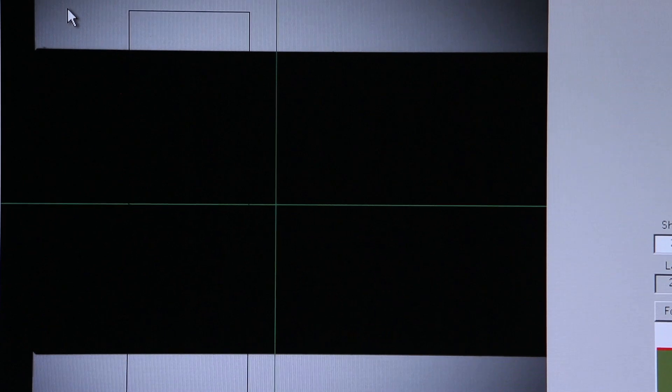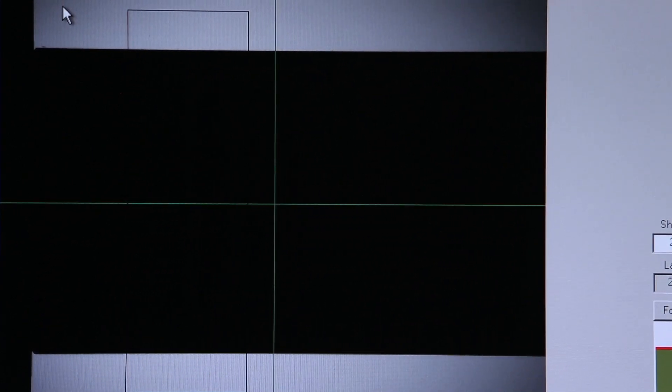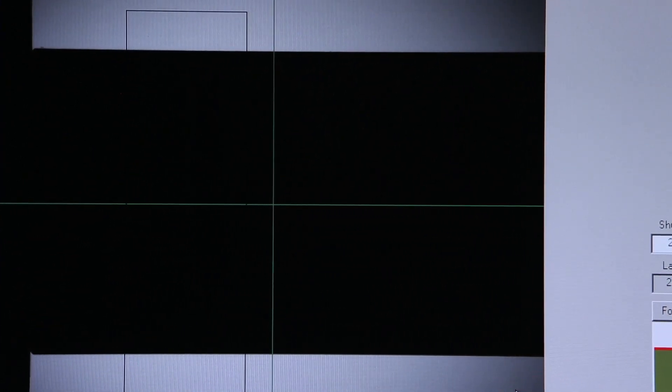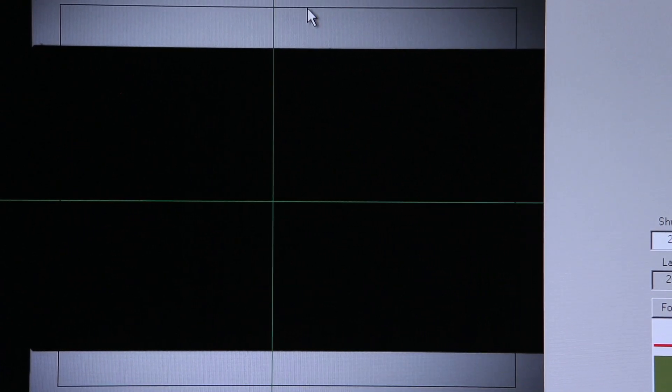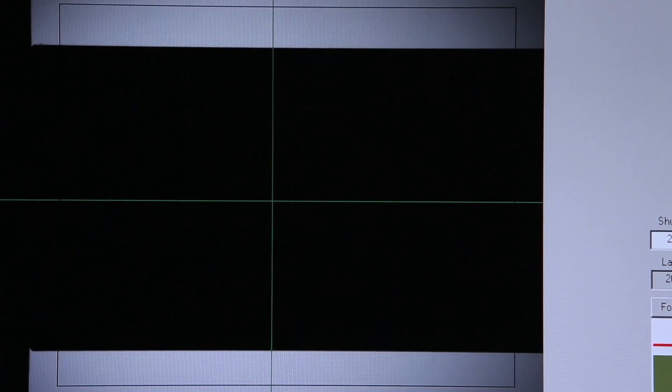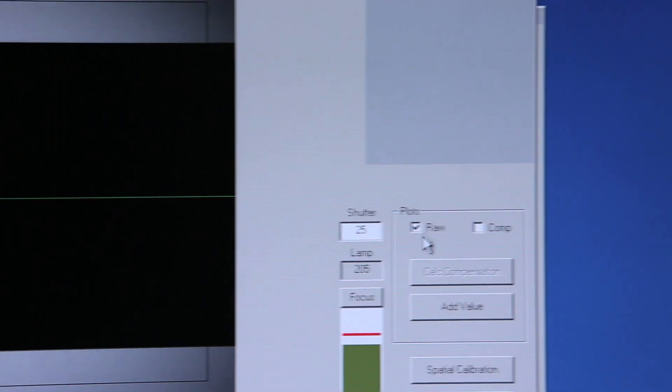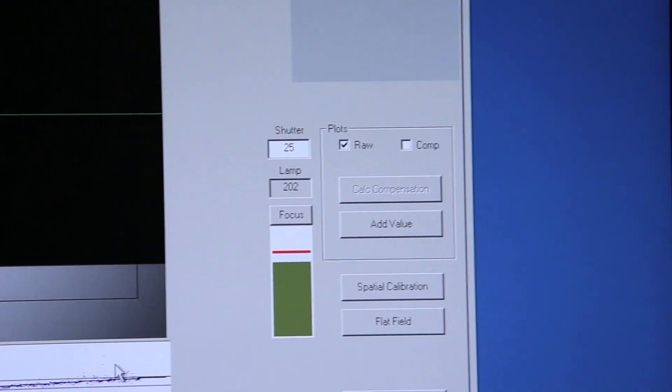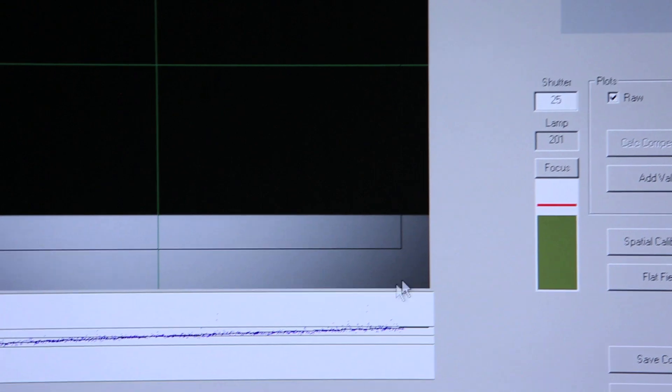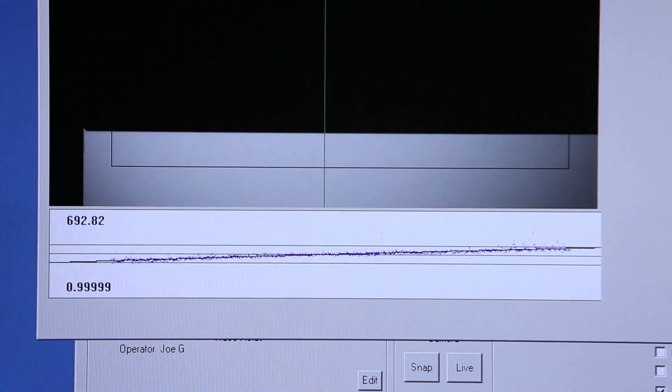I'll start by creating a window around my one-inch gauge pin, trying to get roughly the same amount of gray pixels on the top as I get on the bottom. I'll now click my Raw Plots button. We're looking for any high spots on the pin.